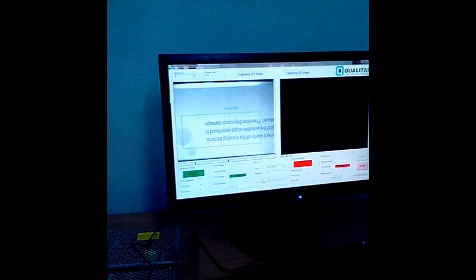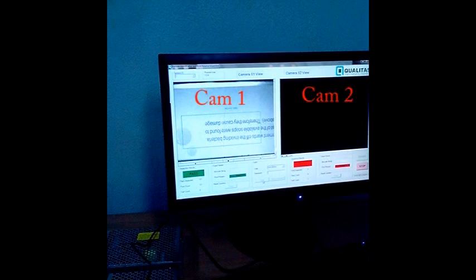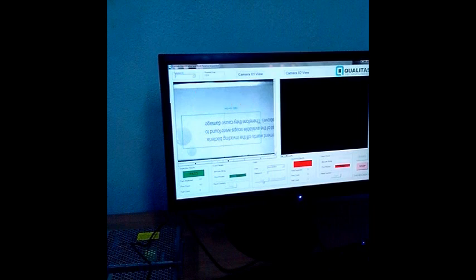The output of the cameras are displayed on a PC monitor as shown. In this demonstration, camera 2 is turned off, thereby causing cam 2 output screen to go black as can be seen.